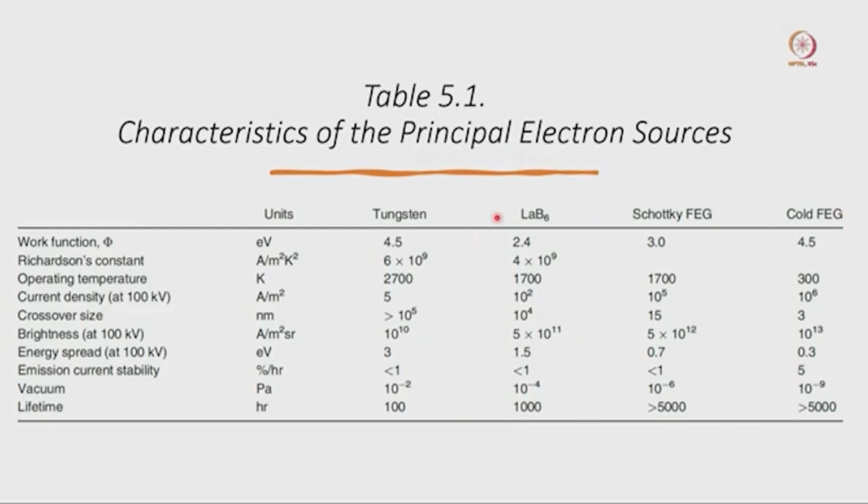For normal room temperature TEM we mostly use the LaB6 filament. That LaB6 filament gives good contrast, and we can use any kind of electron dose. One more thing we have to remember: for the cryo sample we cannot use a very strong electron beam, our electron dose will be very limited. So the contrast will always be poor for the cryo sample, and that is the reason the field emission gun is always helpful.